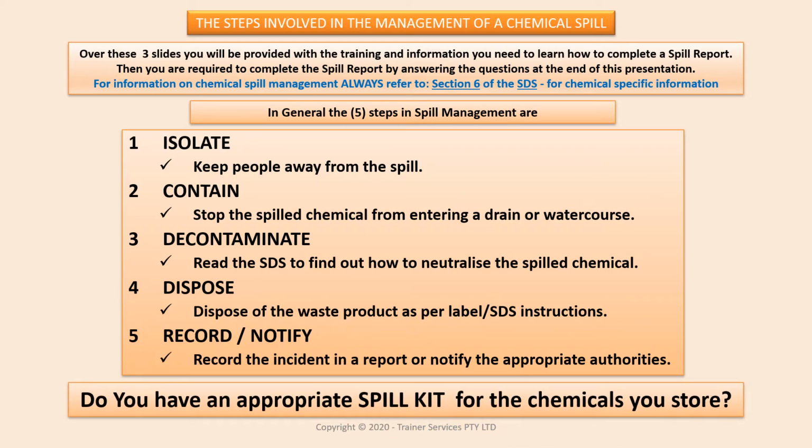In all cases, you can only control a spill properly if you have a spill kit that is appropriate for the chemicals you store.